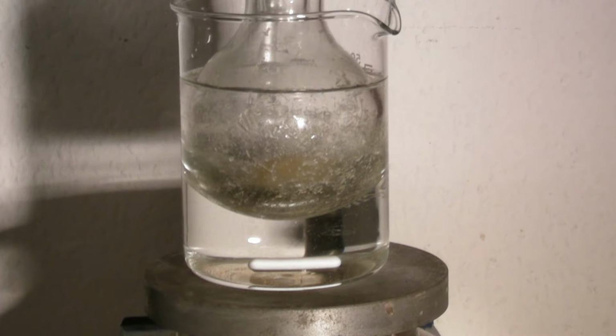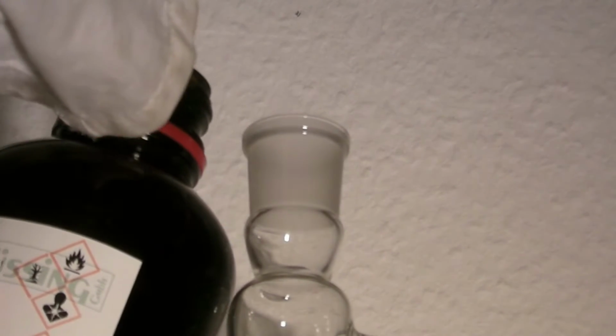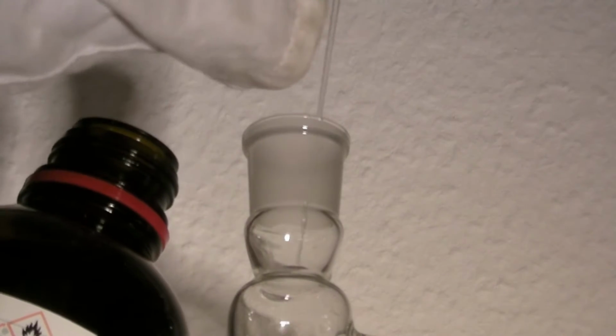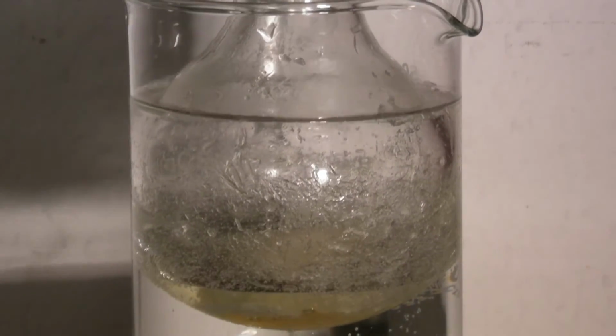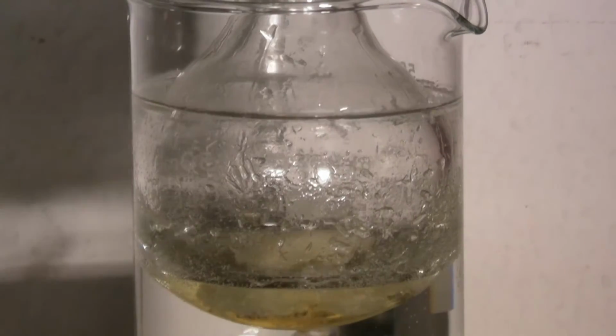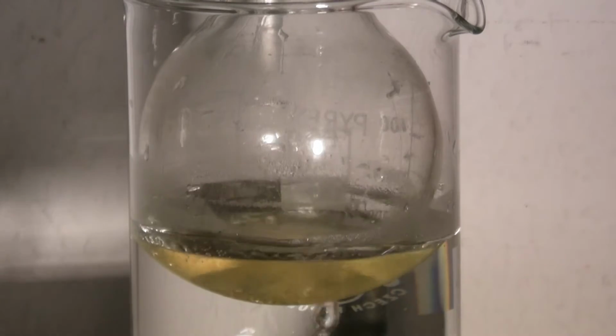Petroleum ether is used as the solvent, which is a mixture of different hydrocarbons. It doesn't have an exact boiling point, but it boils between 40 and 60 degrees C. Through the condenser, a few milliliters of solvent are added at the beginning. The water bath is heated until the solvent begins to boil. Then more solvent is added in small portions until the benzhydrol has dissolved.